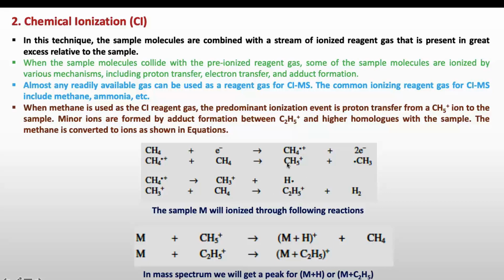So finally, this CH5+ and C2H5+ are important to convert our sample molecule to ions. Now this CH5+ collides with M, our sample molecule, and converts it to M+H, meaning it's doing proton transfer. Second, when M collides with C2H5+, it makes M+C2H5, meaning adduct formation. In both cases, a cation is forming.